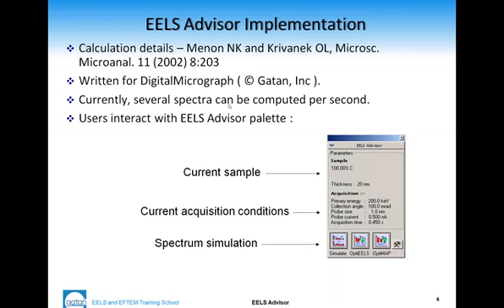Currently, several spectra can be computed per second using the software, and basically the main interaction with the software is through the palette that you see here. This EELS Advisor palette is basically the main interaction between the user and the software.